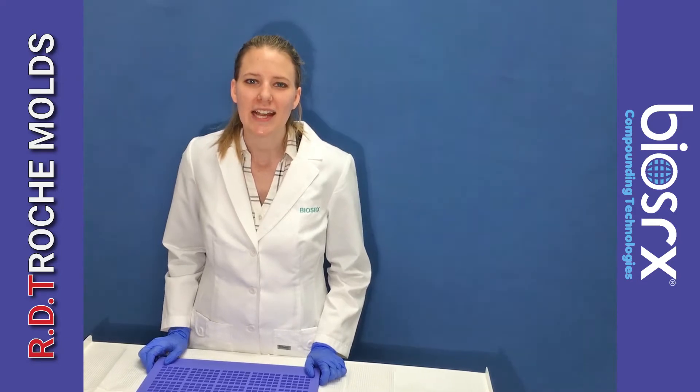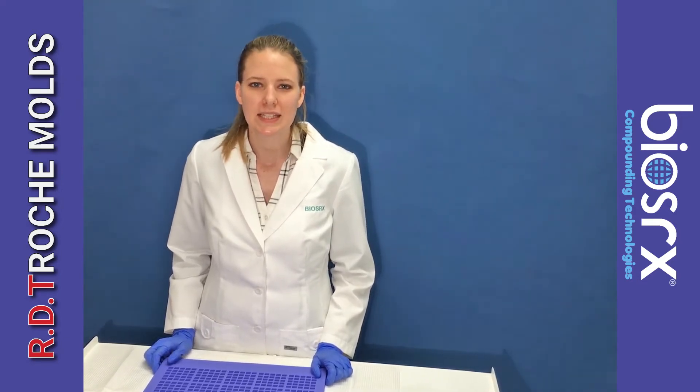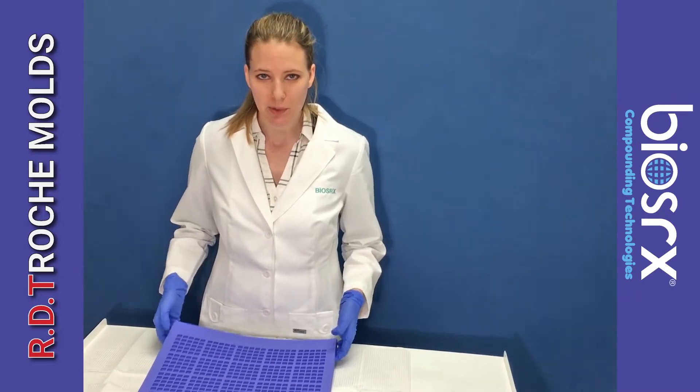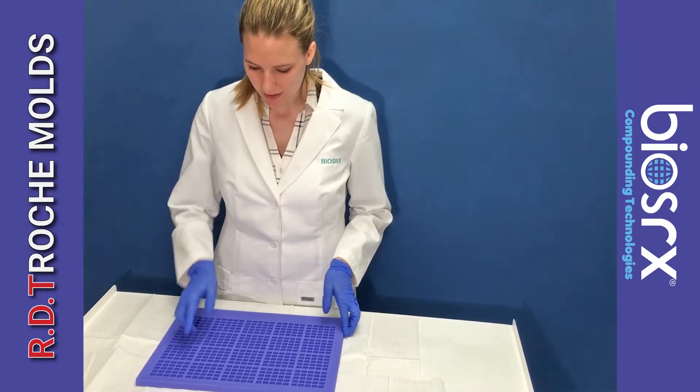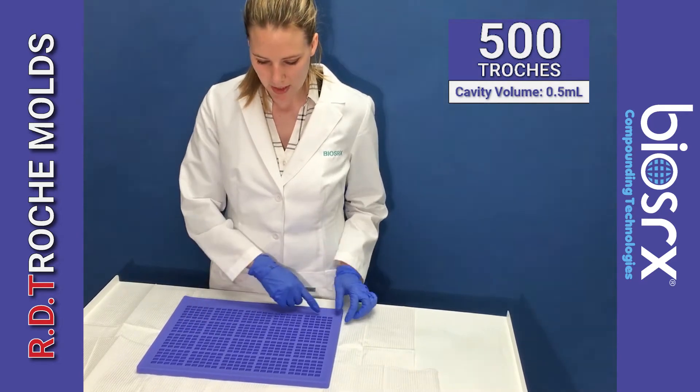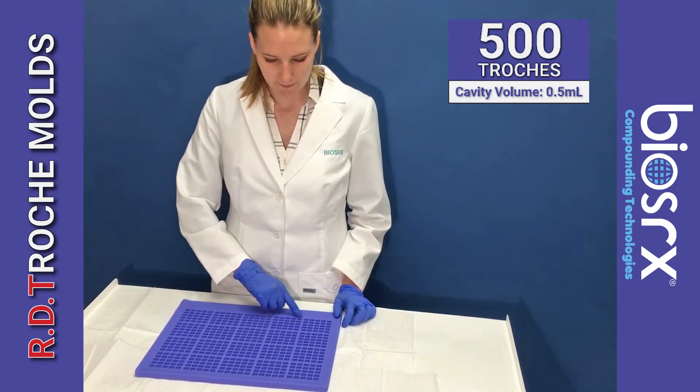Hello, this is Jennifer and I'm happy to introduce the latest mold from BIOS-RX. This is an RD trochee mold and as you can see here, this can make 500 trochees — each cavity is a half ml.